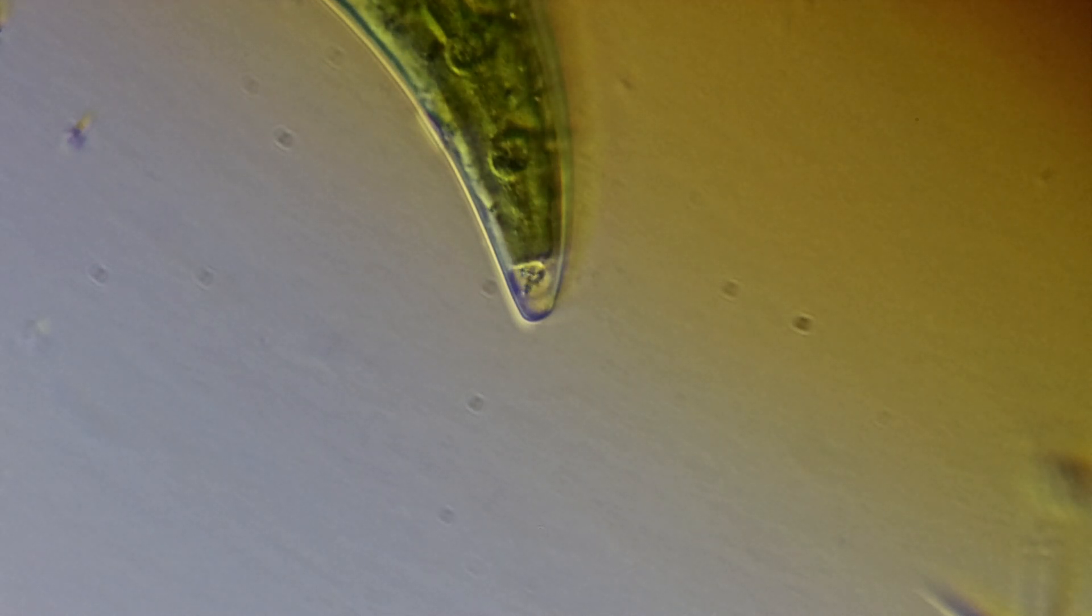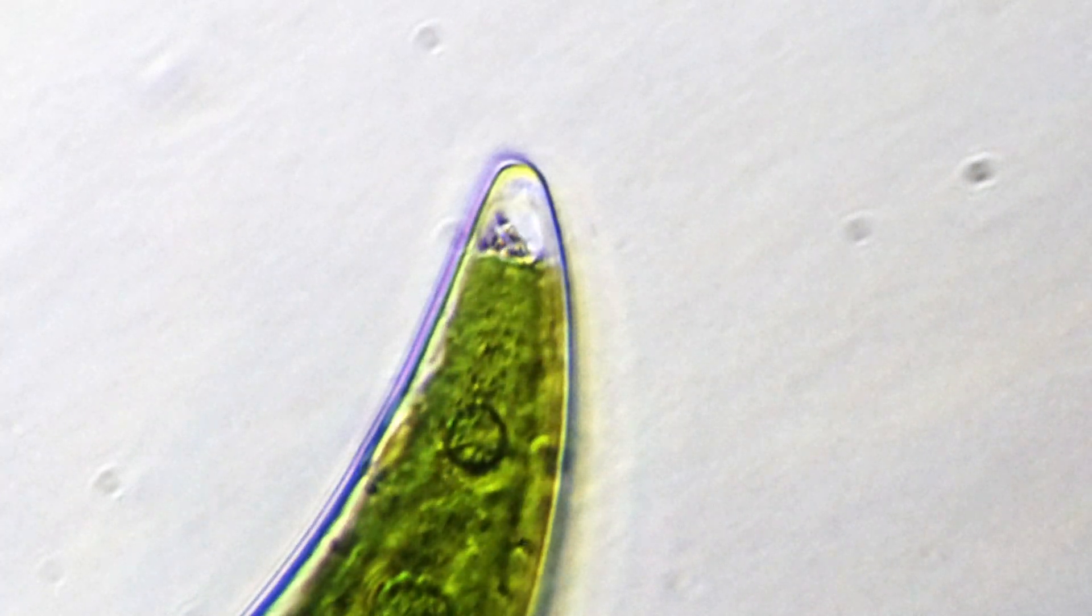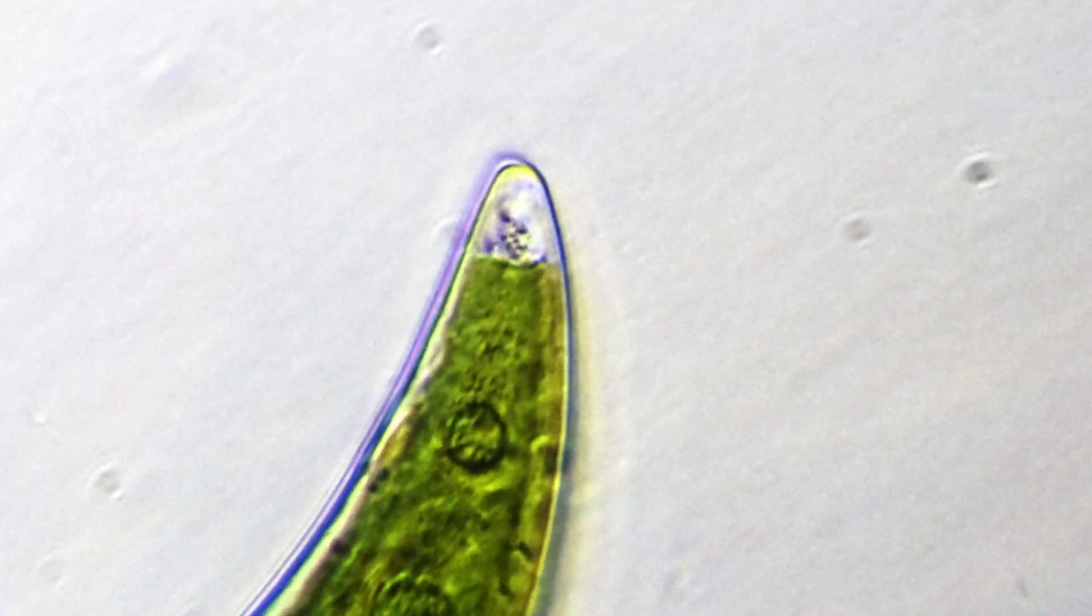When we rearrange that light and get very close to a Closterium we see it has a clear point at either end of its banana-shaped tips, little vacuoles filled with tiny particles so small that to really see them well magnification must be at least 600 power, and here we are looking at them at 800.